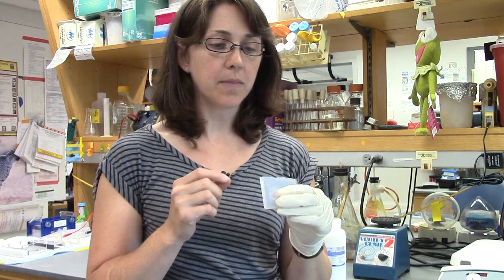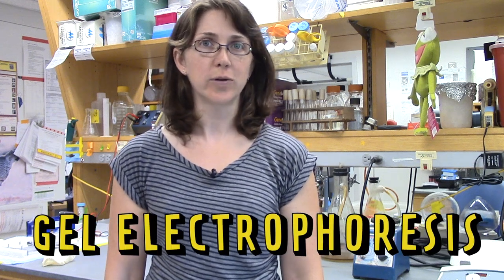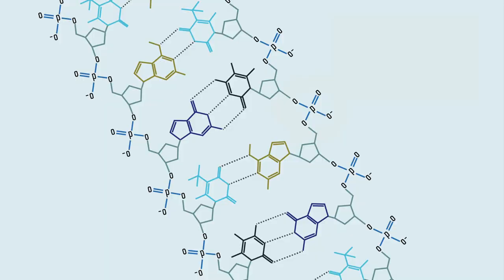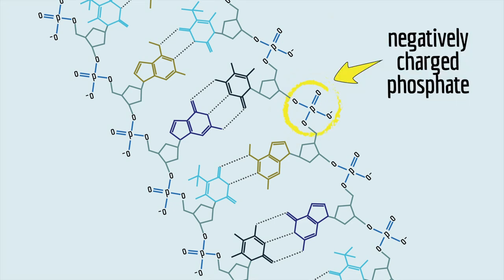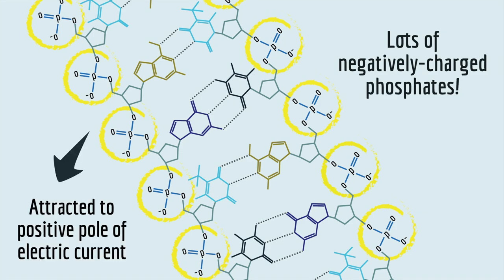But unlike jello, this gel has holes that are just the right size for DNA molecules to snake through. The problem is, unlike my yarn example, we can't use gravity to pull the DNA through the gel. We use instead an electric current. That's the electrophoresis part of gel electrophoresis. An electric current pulls the DNA through the gel, because DNA has this big, negatively charged phosphate on it, which makes it attracted to the positively charged pole in an electric current.